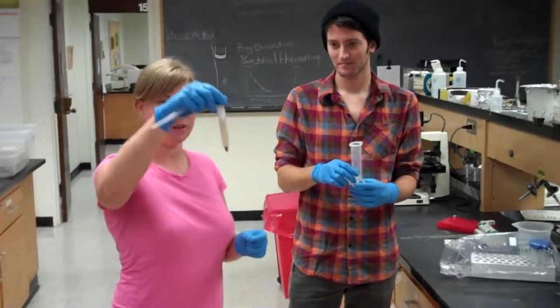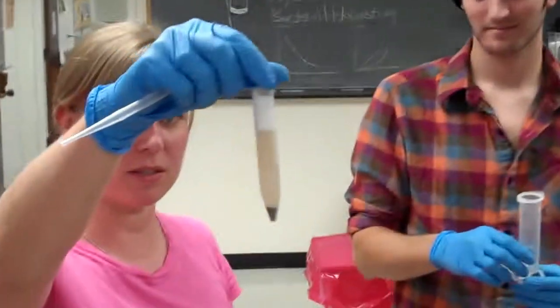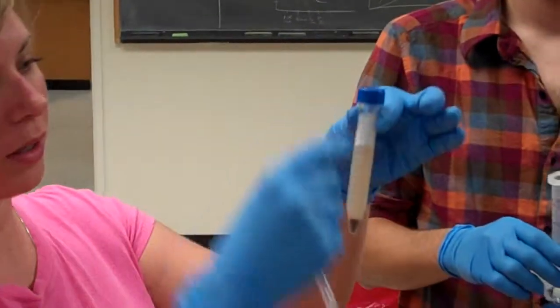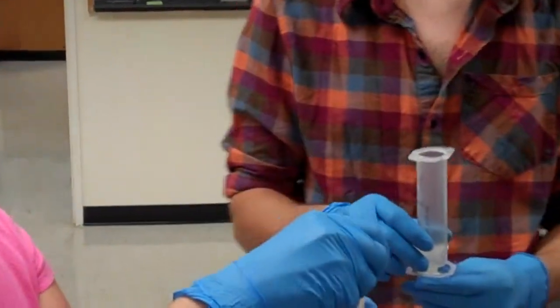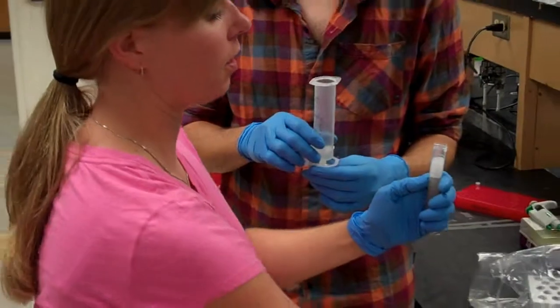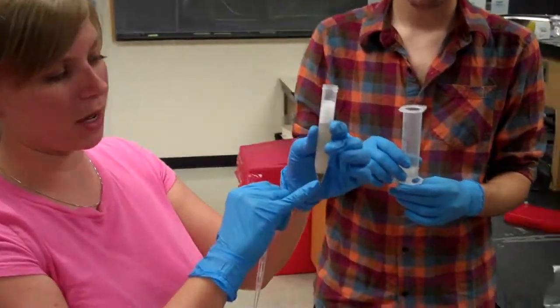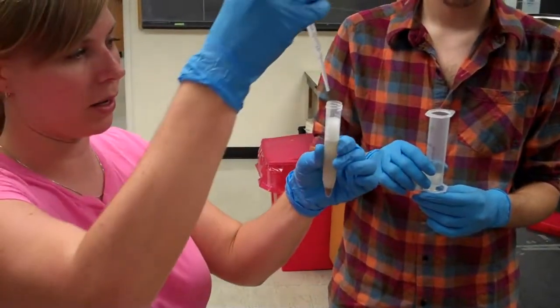After you centrifuge, your sample should look like this. So we want to collect all of this in here. Try and not get any of the white bubbles on top and definitely not any of the pellet at the bottom.